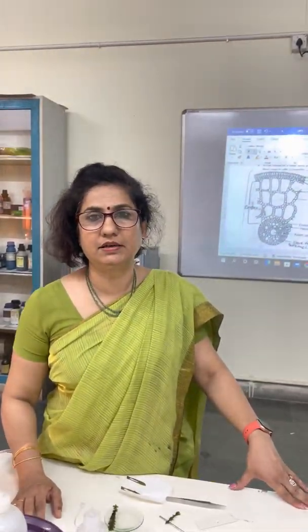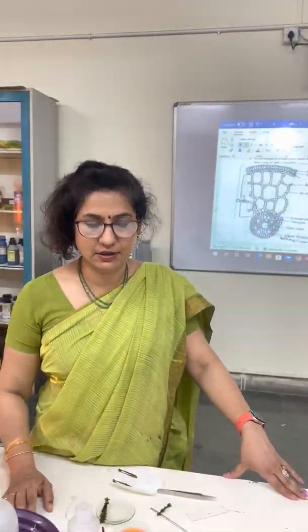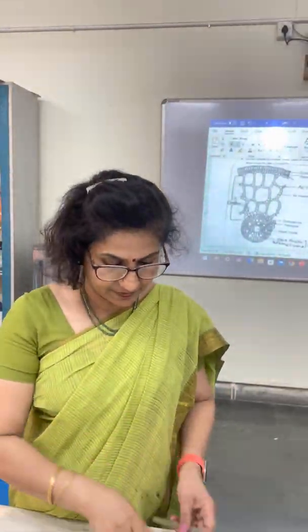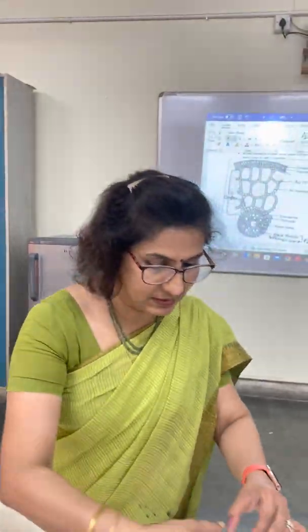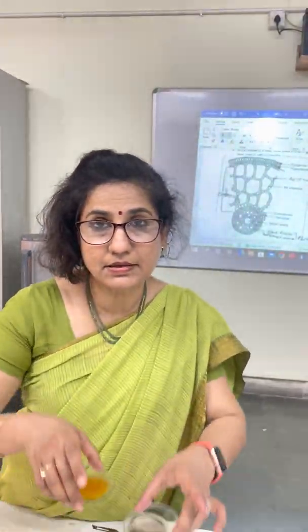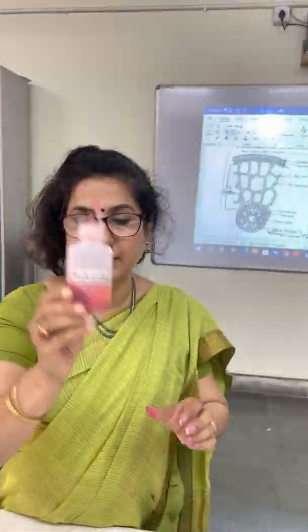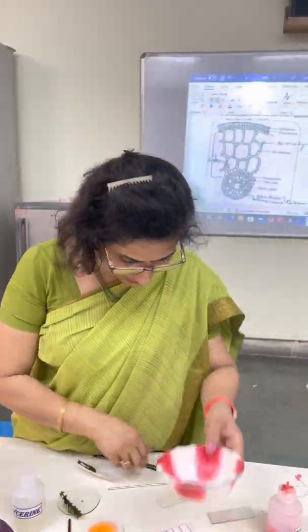I have taken Hydrilla stem for this. The materials required for this experiment are a surgical blade, a forcep, a needle, slide, watch glasses, glycerin, safranin, water, and cover slips.